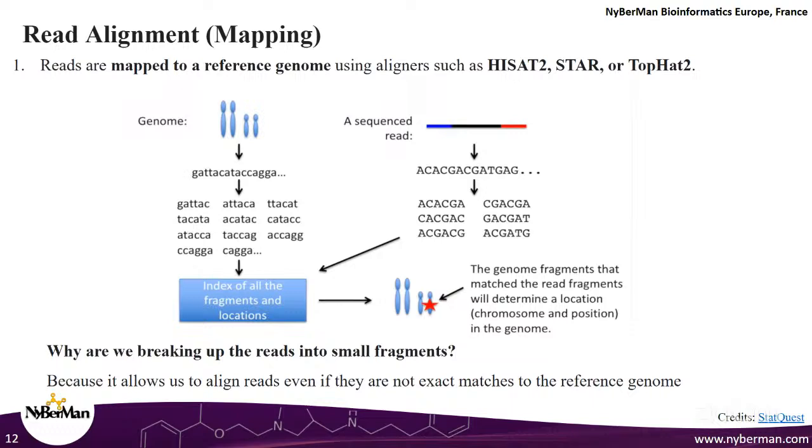You can go to that index page, look for the word there, and there the coordinates are already mentioned, right? That okay, this word has been mentioned on this page, maybe on page number 213. So you can directly open page 213 and actually see the word there. That is how indices work, right? This is exactly how indices work in bioinformatics as well.